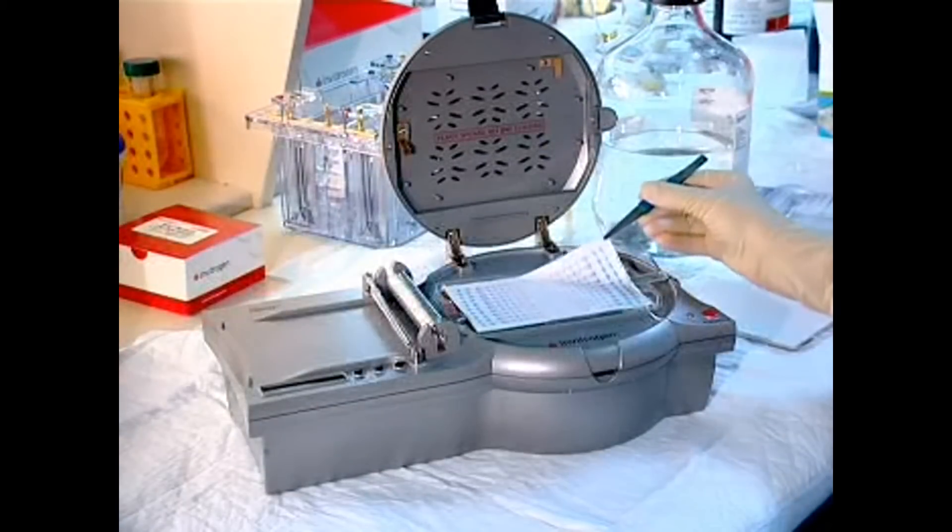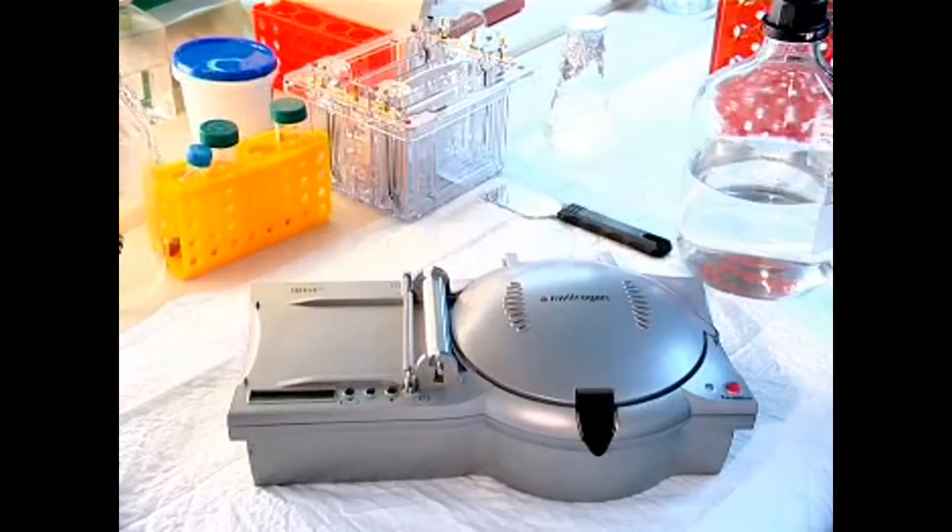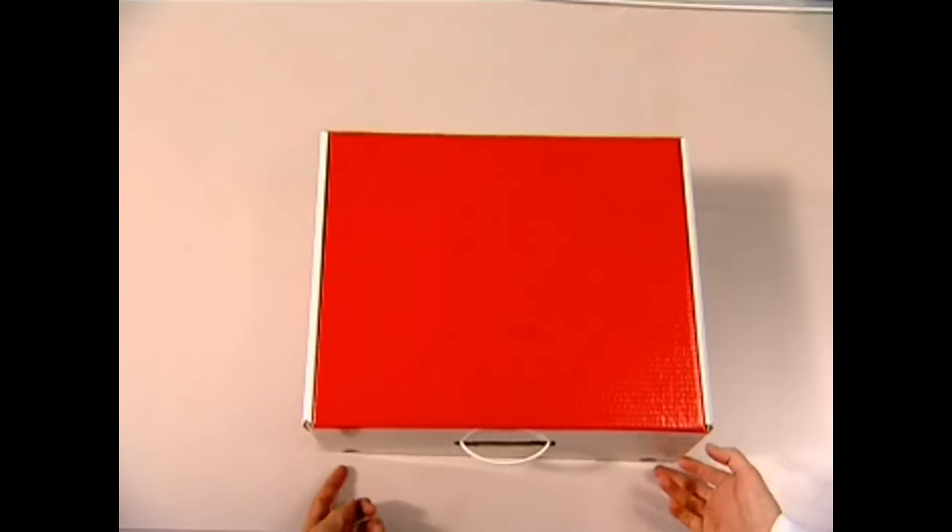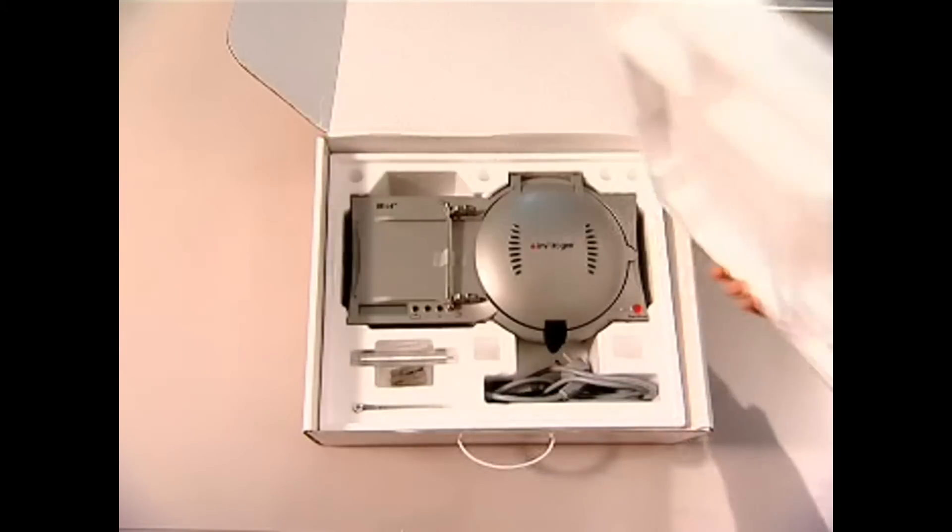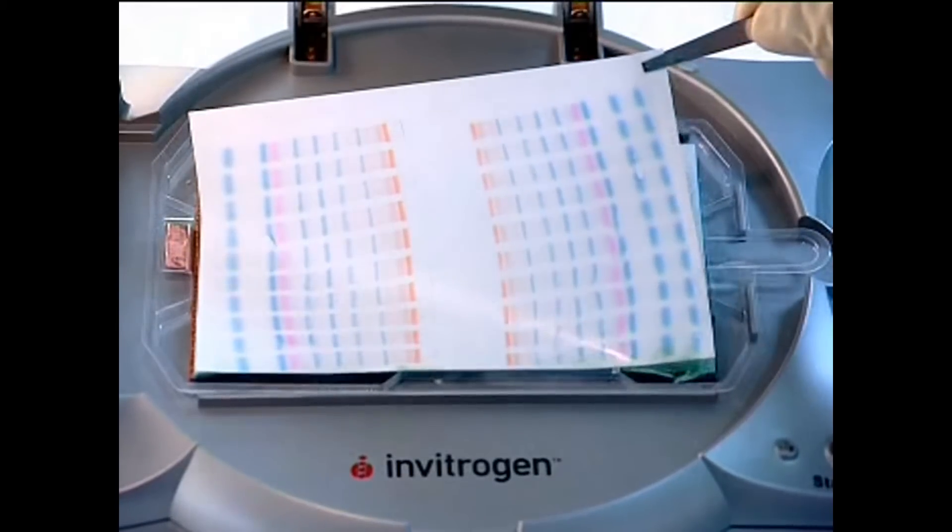What you have just seen is real. Transfer your proteins with amazing detection sensitivity in 7 minutes or less. Ask for an iBlot demo and see for yourself how proteins are transferred reliably and evenly every time, in no time.